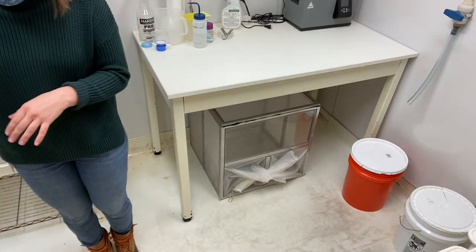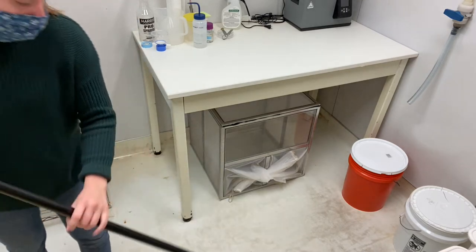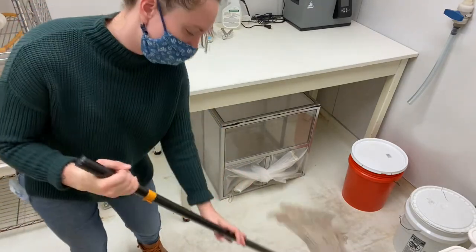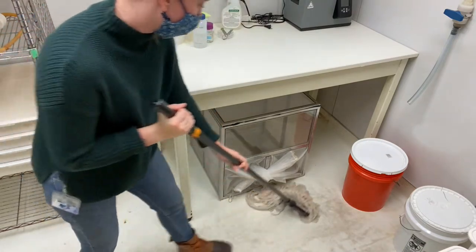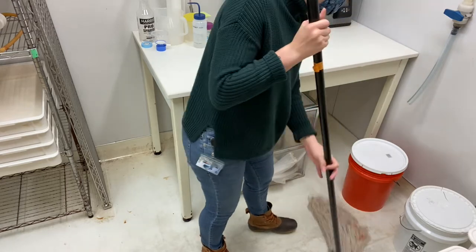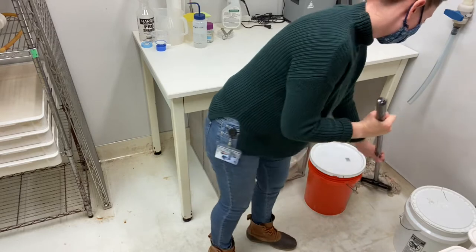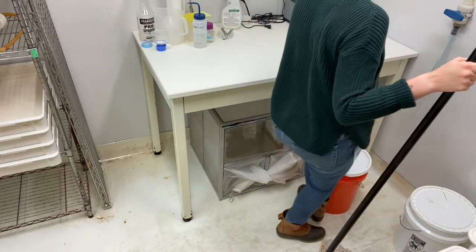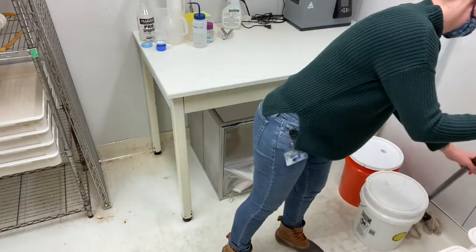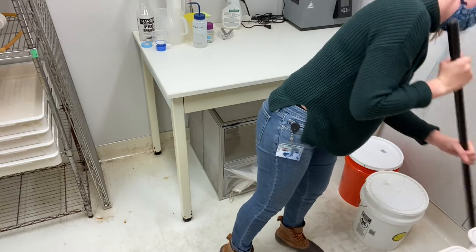Then I put the mop back in the bucket, get fresh water, and do the other half. Make sure you get as far under the shelving as you can, and get under these shelves. Move the buckets so you can get behind them because sometimes water gets back in and gets moldy. Make sure you get in the back corner and that it's clean.